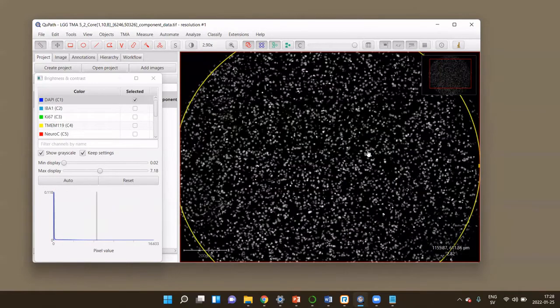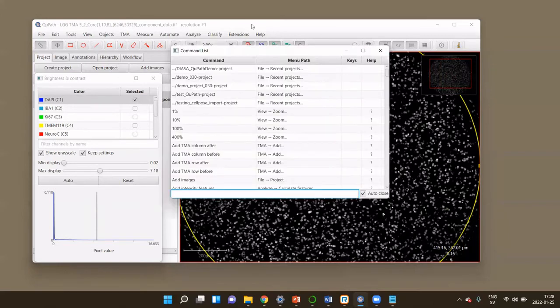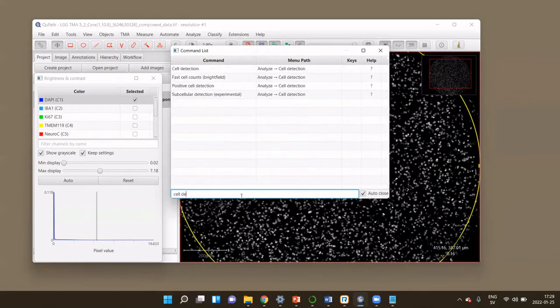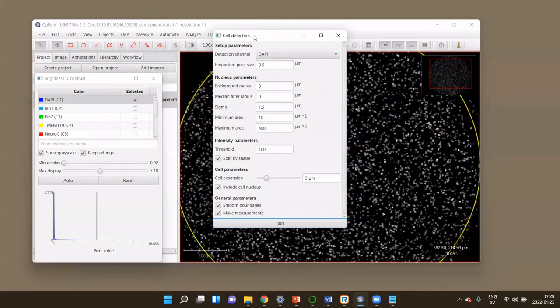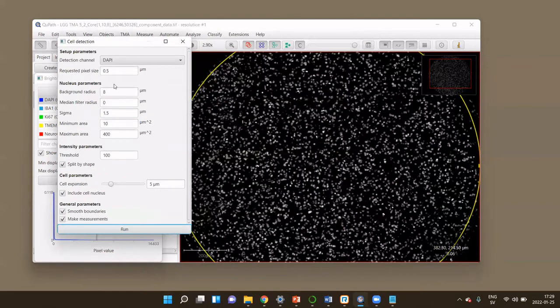The next thing I would like to do is detect cells. There's one command in QuPath called Cell Detection. There's a command search bar you can open using Ctrl+L on a Windows computer, so you can find commands and start typing what you're searching for. We're looking for Cell Detection, and we execute that command by double-clicking on it. Then we go to the Cell Detection dialog menu.